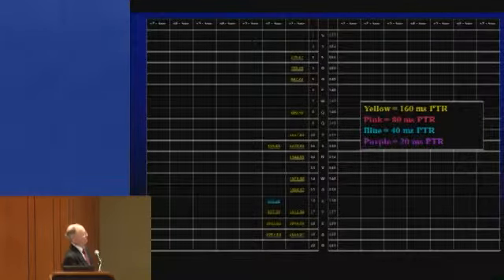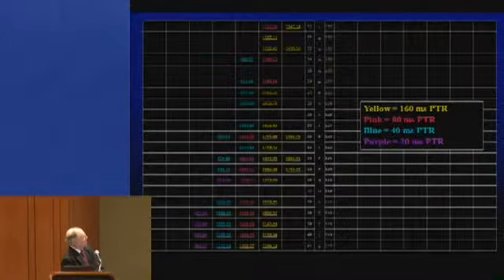And these are just the reaction times that you use to do the proton transfer and simplify the spectra. So what we did initially was long proton transfer, and we see singly charged ions. We couldn't find the amine terminus because these two guys weren't there, so we did chemistry, and we filled that in, no problem. And now we keep reading along and get further into the sequence.